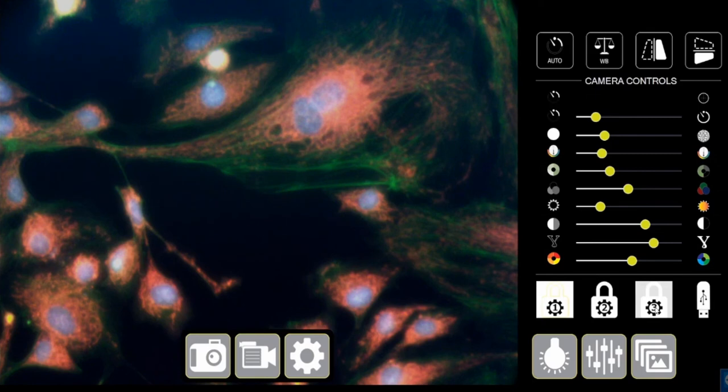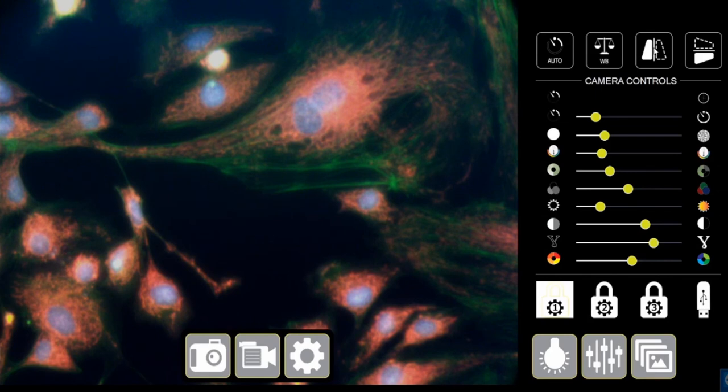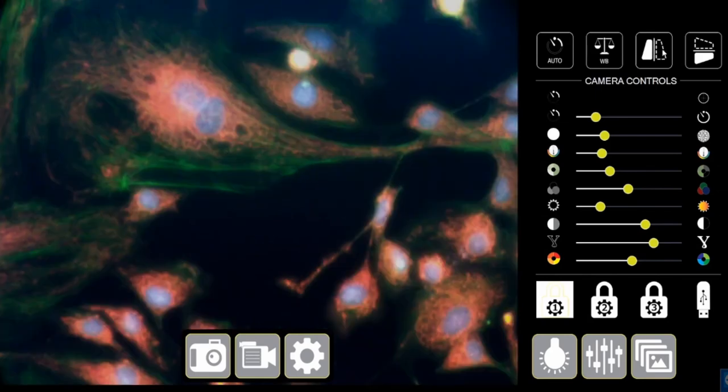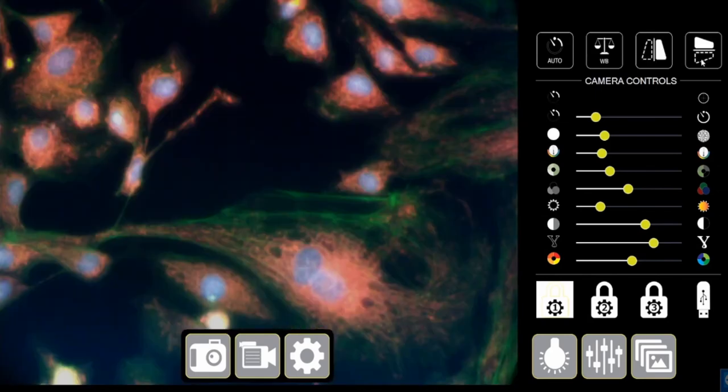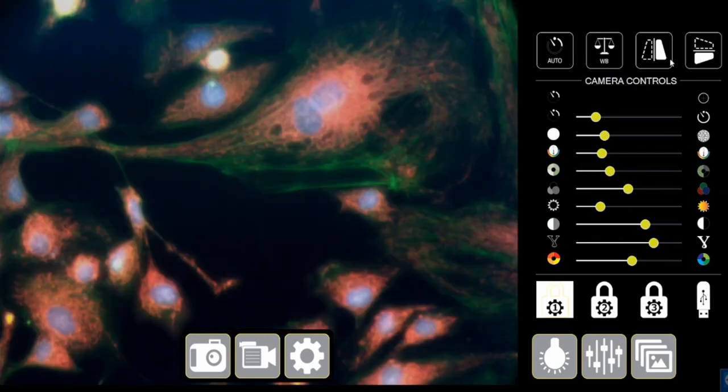So then you have the flipping option here. You can flip your images sideways. You can flip it upside down. So vertically and horizontal flipping. This is your white balance button.